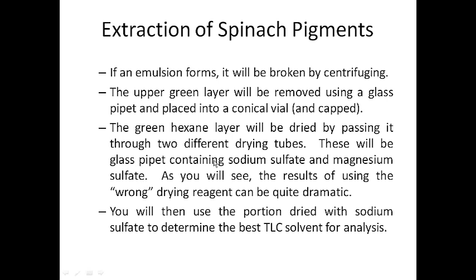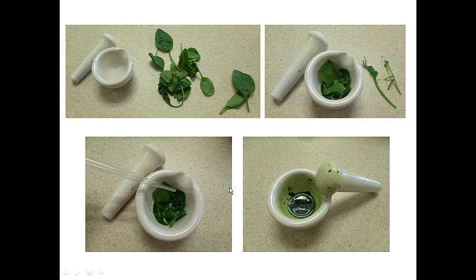And you'll see that the choice of drying reagent here is important because something will happen when you use magnesium sulfate that won't happen with sodium sulfate. You're then going to take the dried portion with the sodium sulfate, and we're going to determine the best TLC solvent for analysis.